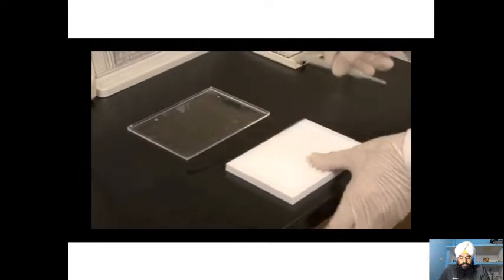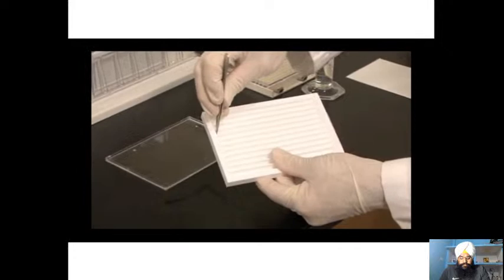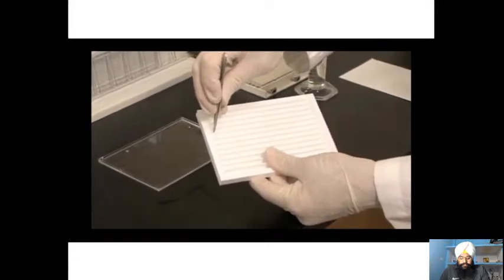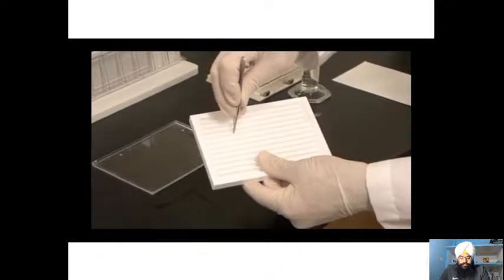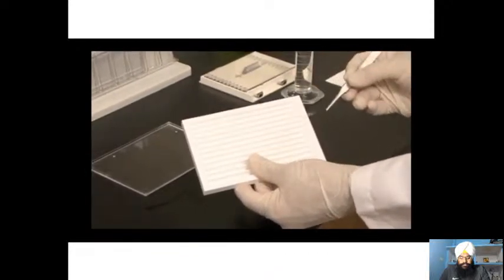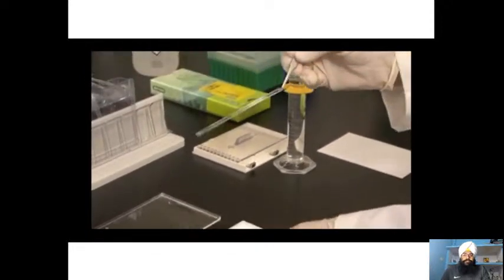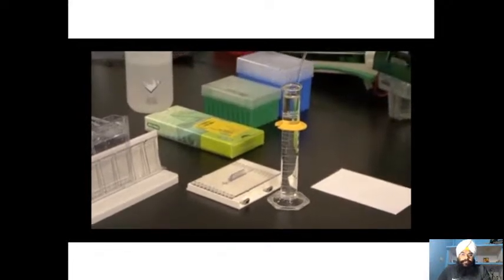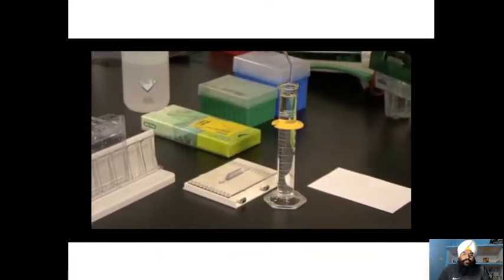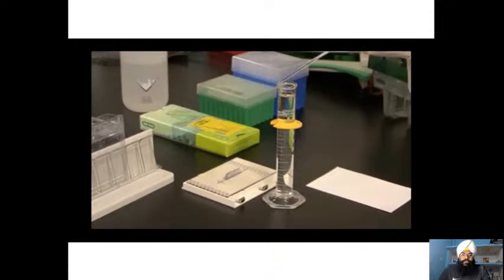To remove the strip from the tray, place the forceps on the tray and gently push on the plastic backing of the gel to push the strip towards the angled edge. Lift up the strip from the right tab. I am going to rinse the strip off in running buffer that I have previously prepared. Dip 2 or 3 times. This will remove equilibration buffer number 1 and 2 that may still be on the surface of the IPG strip.